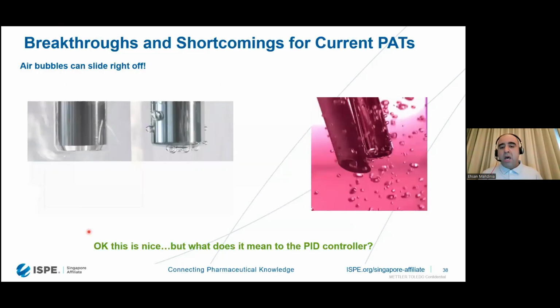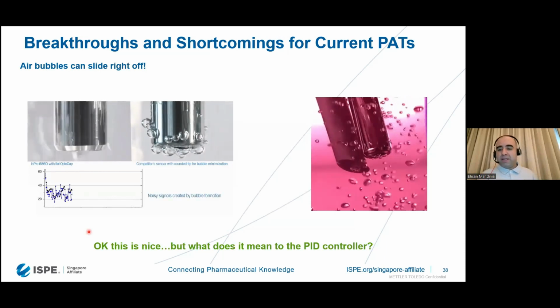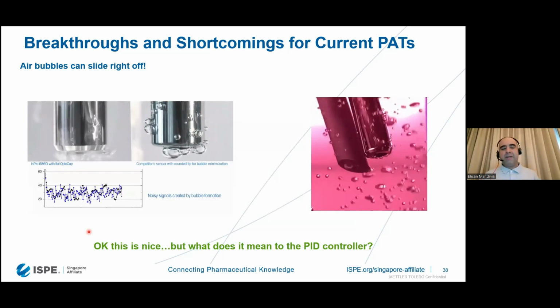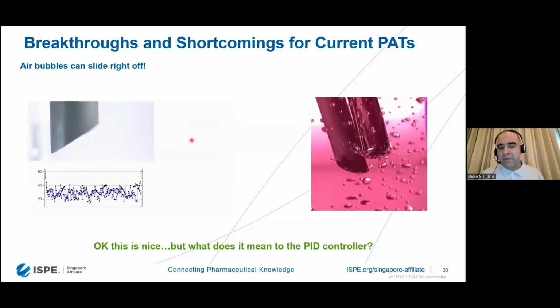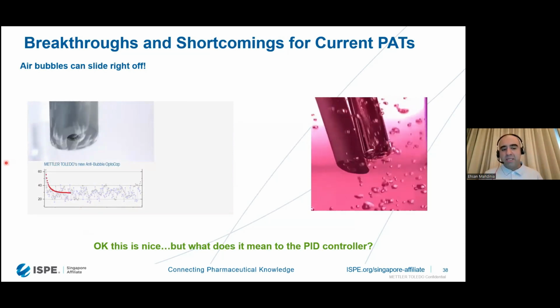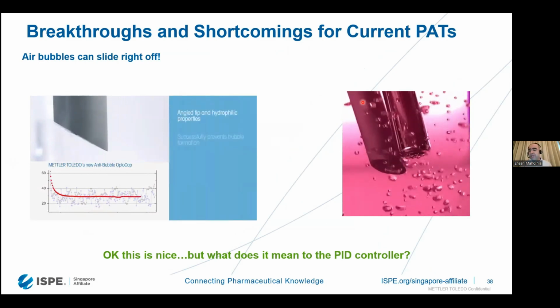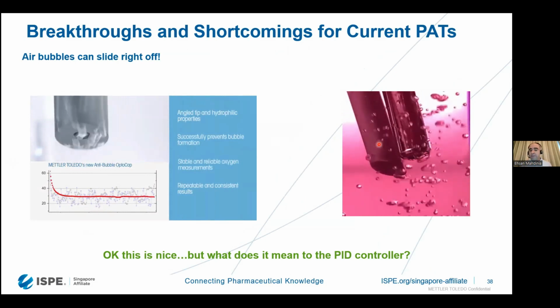But also for those two big challenges that the DO measurement faces, and in this case CO2 also faces those challenges to some extent, is the bubble sticking to the surface, to the tip of the sensor. And those bubbles, you can see, create a noisy signal. However, we have a special extra finish on that tip now. We call it the anti-bubble optocap.